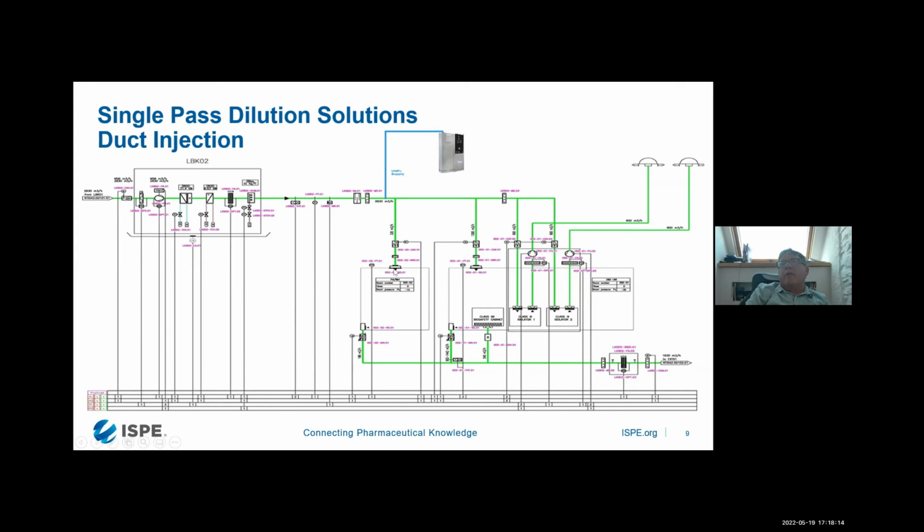But we learned, although they have 20 air changes per hour, if you have the exhaust on the ceiling, you can have a kind of shortcut in air, which is happening for the HVAC, but also for the gas. So if it's on the ceiling, it can take a little bit more time on big volume. 120 is small, but on big volume, we've seen that if the exhaust is on the ceiling, then to reach the corners, it takes more time. So even if the people are claiming 20 volume changes per hour, it's happening here, but definitely not at the corner.